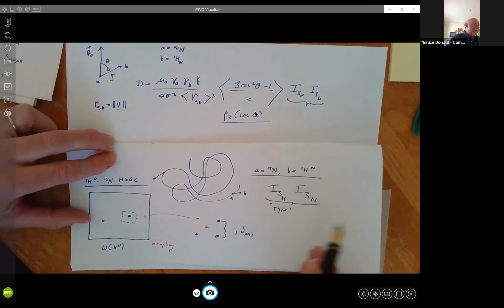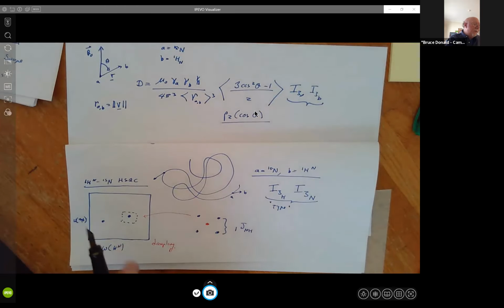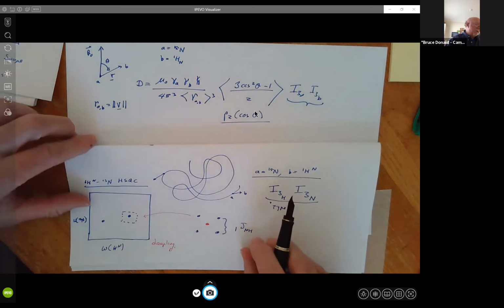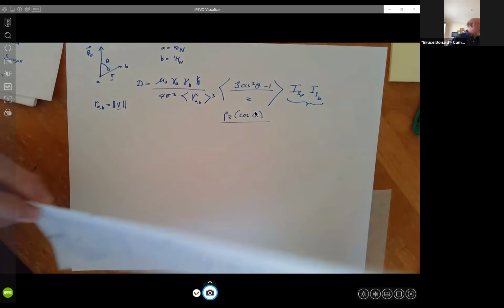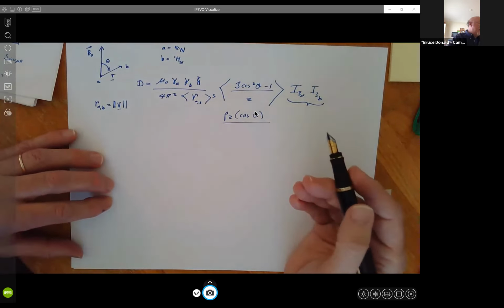All this means for us is that if we do these operators, this effect will appear in an experiment that has the same operator. So we should be able to see this in an HSQC experiment. How is that going to work? Let me continue to parse that as I talk about what we'll actually see.